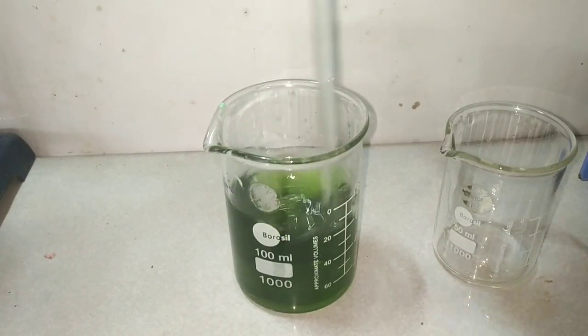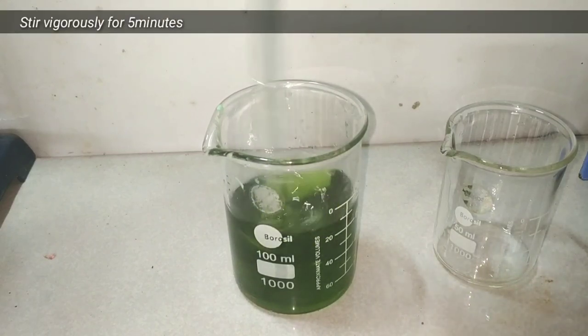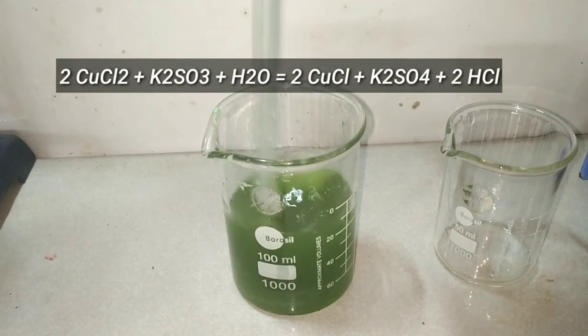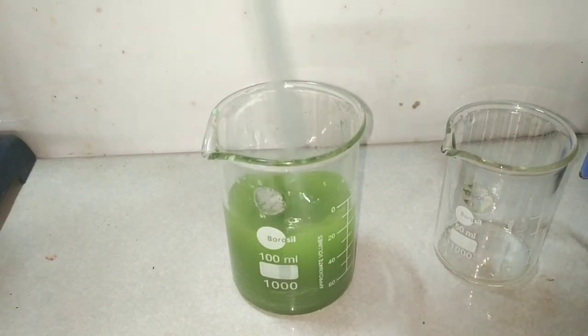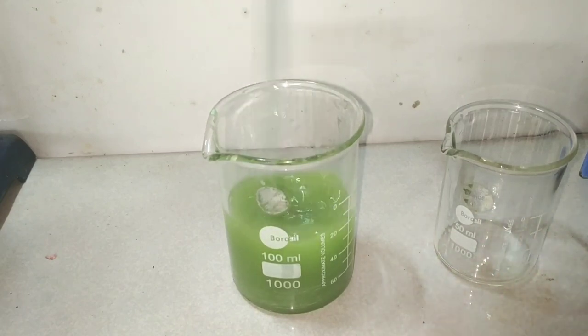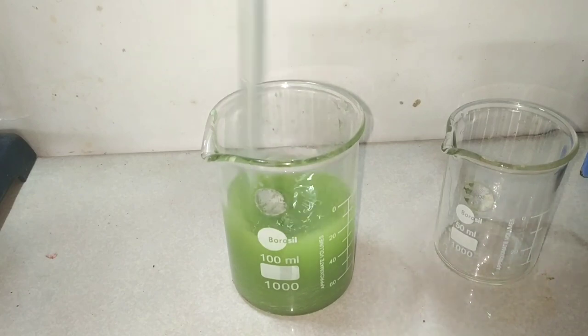Continuously stir the solution until there is formation of a white colored precipitate. What's happening here is metabisulfite, being a reducing agent, converts the copper 2+ to copper 1+, which precipitates out as copper 1 chloride. This precipitate is very heavy — almost 4 times the specific gravity of water — which is why it settles down very fast.